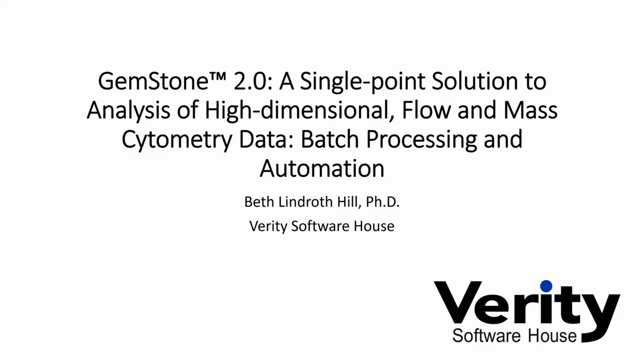From its inception, GemStone was designed for automation. As cytometrists were able to add more and more measurements to their analyses, we realized early on that the ability to automate high-dimensional data analysis would be necessary to provide efficient and objective results. Today, we're going to discuss the features that help to make this automation possible and unique.